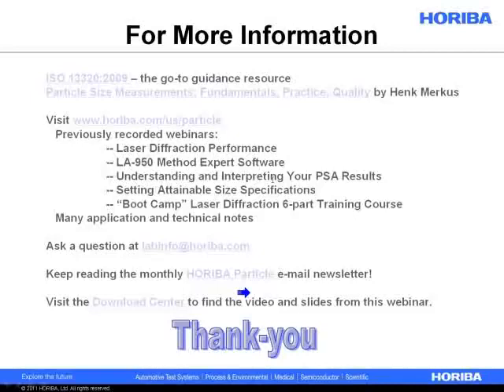Where things get a little bit more complex is if it's not the same material, if you're mixing 2 different materials that'll have 2 different refractive indices, then you have to sort of come to a decision. Do you use one refractive index? Do you use the other refractive index? You can make a measurement, recalculate it with both, and say that when I'm using the refractive index of my small particles, that gives me an accurate small particle distribution, and then when I recalculate it with the refractive index of the large particles, then that part of the distribution becomes more accurate.